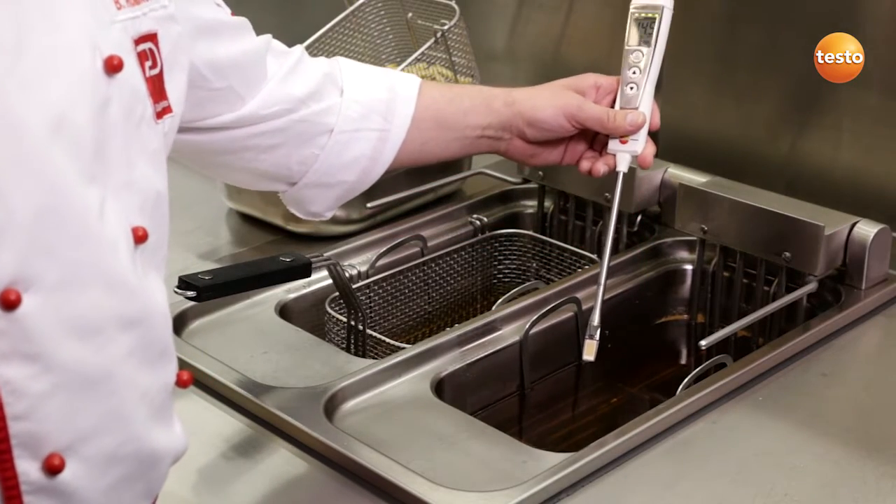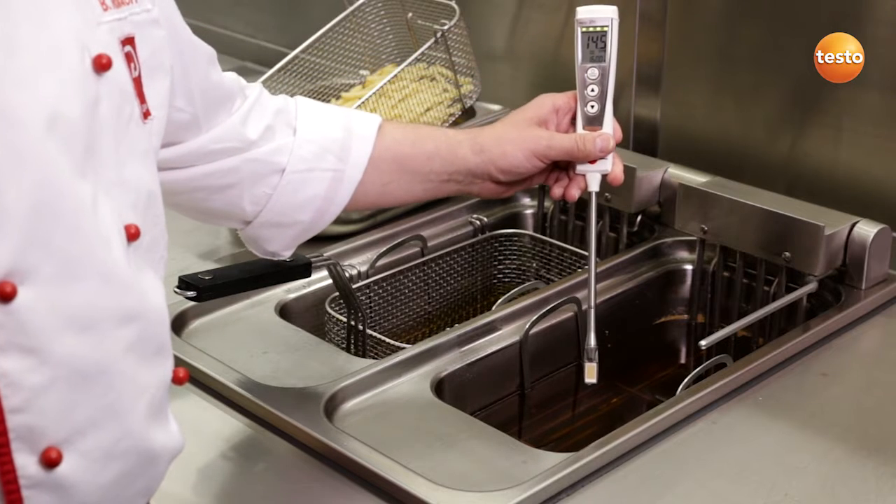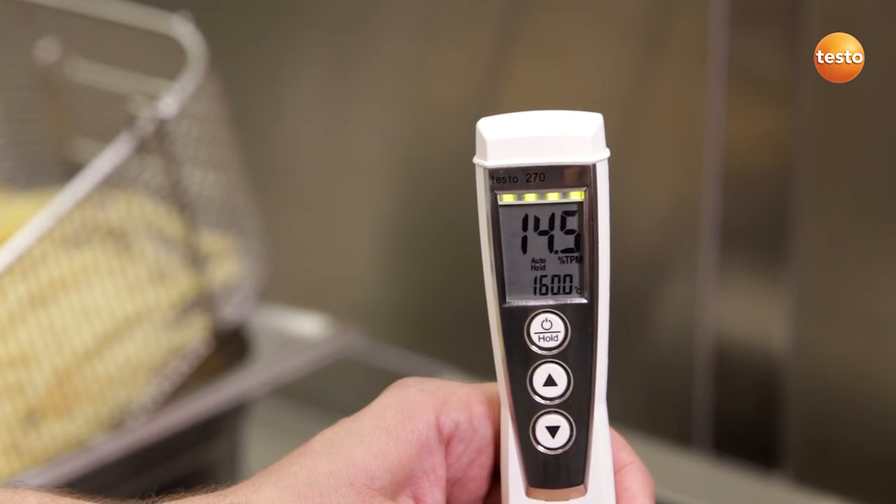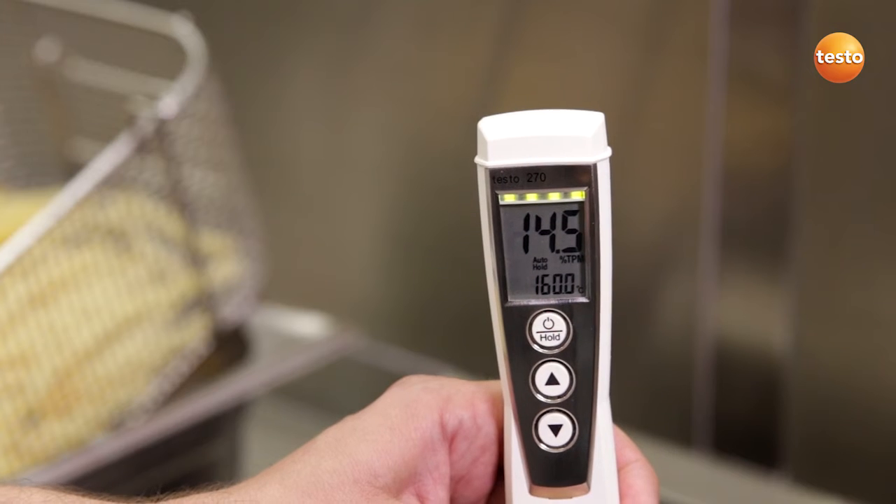That's it. Now I can remove the instrument again. Careful — the probe is very hot, so please don't touch it. And I can now see the quality of my cooking oil in the display. The following measurement values are important.